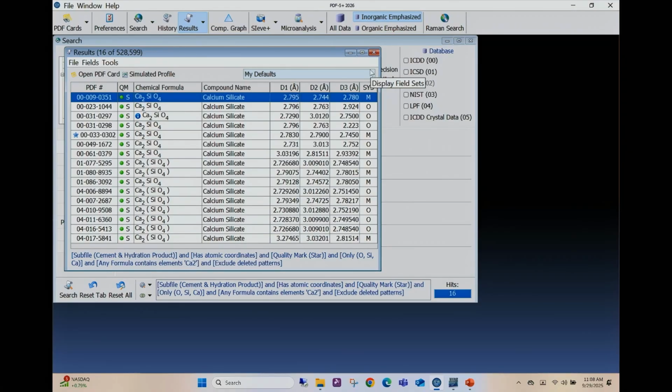unknown. All right. We won't quite say trash. Probably trash light, it depends, because sometimes it's a polymer. The pattern is great, but you're never going to get the crystal structure. Okay? So it does depend, but it's a good point. If it says X, that's going to be one of those caution. Let's take a look at that. What are the comments? Should I be using this or not?